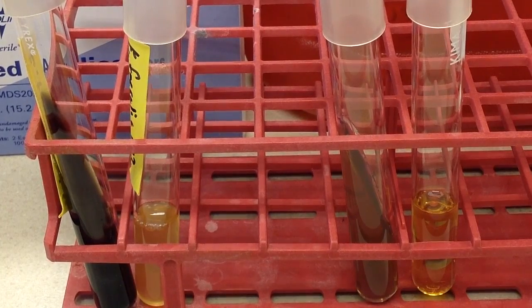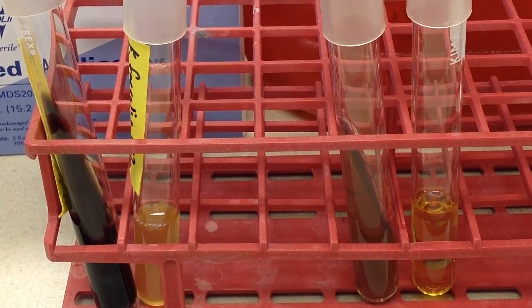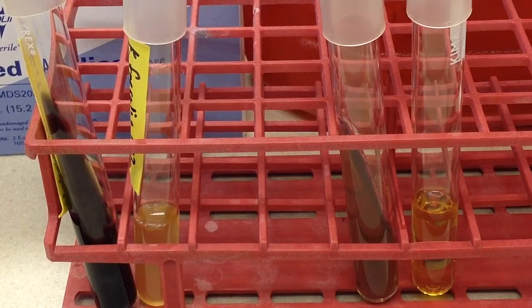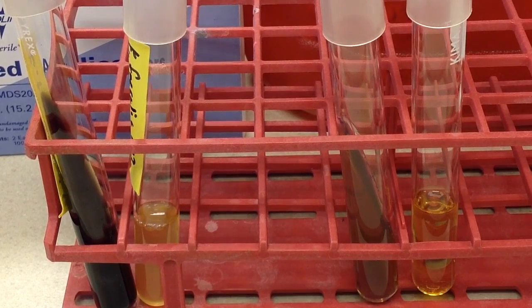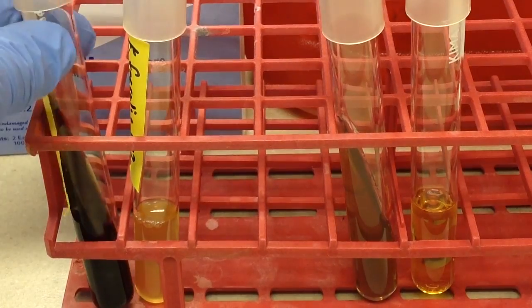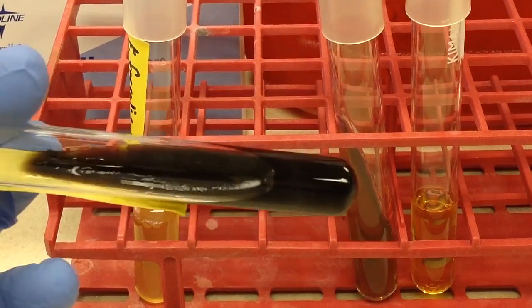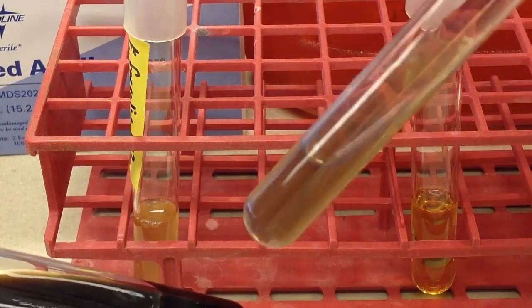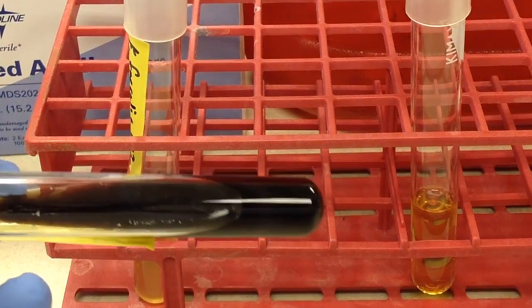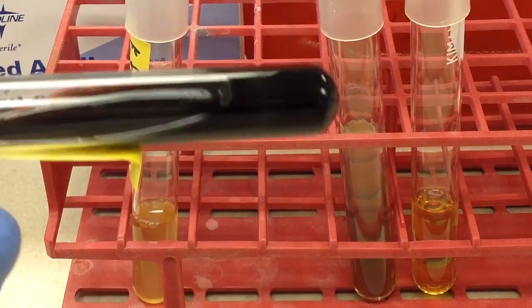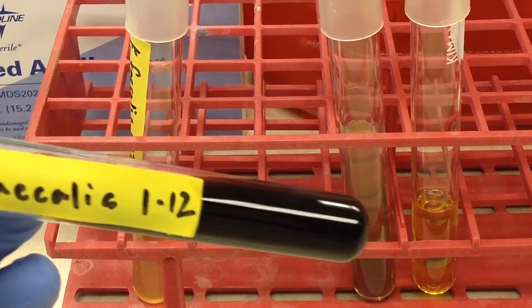So our bile esculin and 6.5% sodium chloride have incubated overnight at 37 degrees in ambient air. And you can see that, this is the regular tube, uninoculated, so it's clearly positive. It's going to turn a black, dark brown to blackish color.